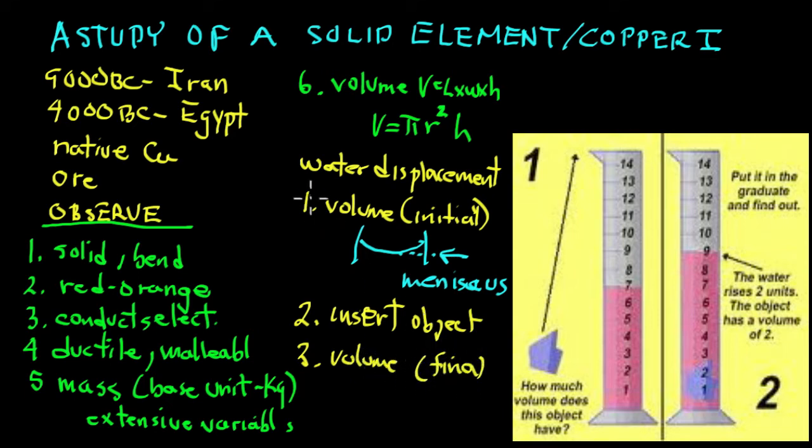And the difference between the initial and final volume is the volume of the substance, copper. And you can get different samples.